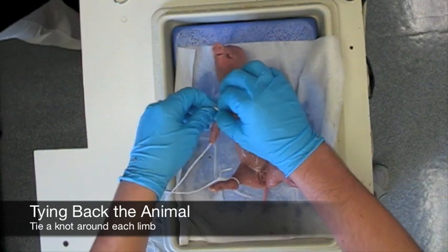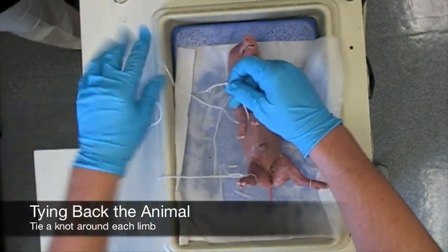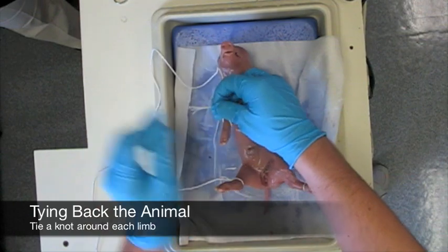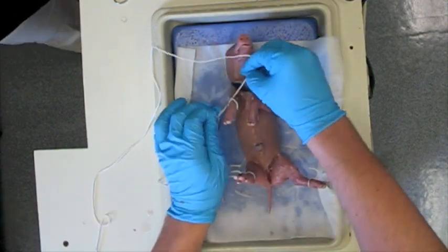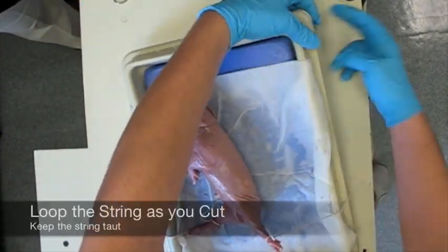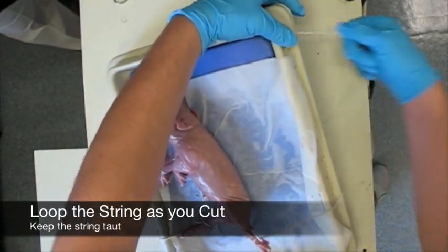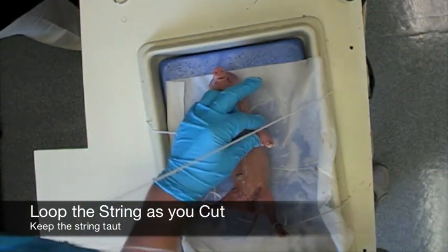To tie back your pig, you are going to want to take a piece of string, which you are going to need to get during your tool session, and tie it around each limb. Make a knot around each limb and then you are going to loop it under the dissection tray to hold back the limbs. As you keep going and cutting further, you can keep doubling up the knots on the limbs to keep the skin pulled back as tight as possible.